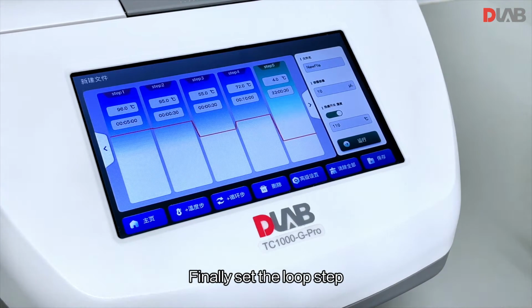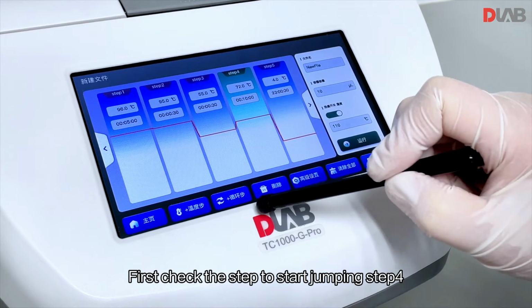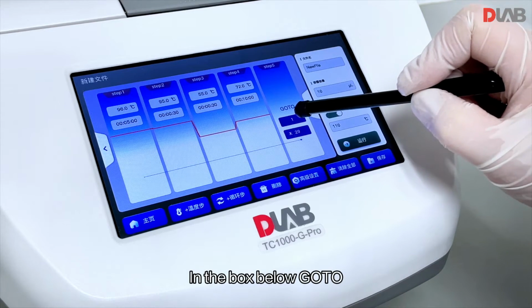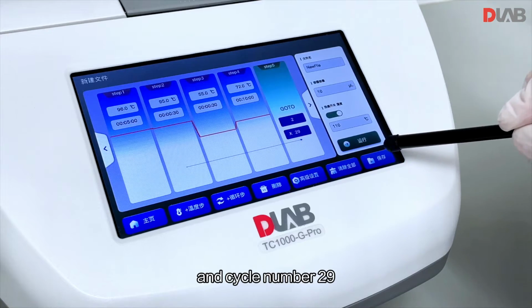Finally set the loop step. First check the step to start jumping, step 4. Then click on plus loop step to add a loop interval. In the box below, fill in the starting step of the loop to jump to, step 2, and the cycle number, 29.